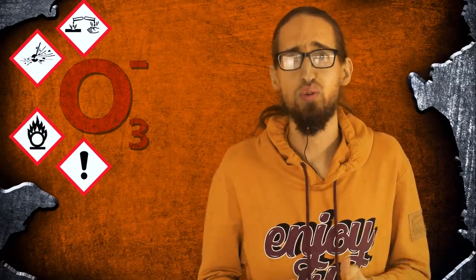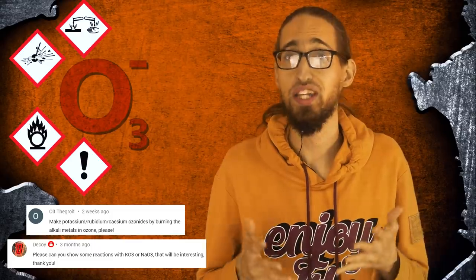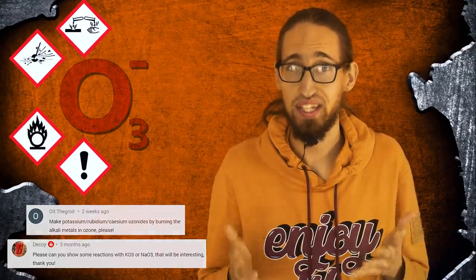Hey guys! In this video, there will not be any explosions that you like so much. I'll just show you the forming of potassium and cesium ozonides, which are quite unique inorganic compounds and totally worth your attention.